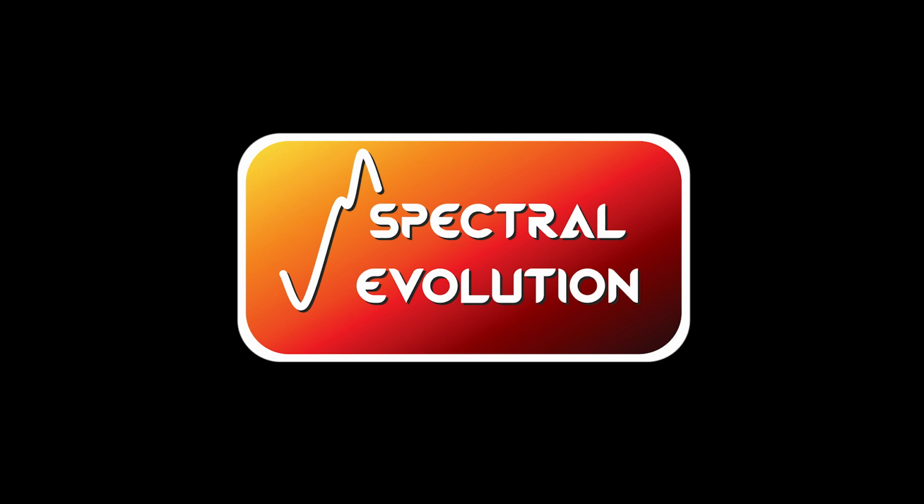We actually have a module in our software called EasyID, which allows you to compare an unknown spectrum to a reference library. By doing that, you can do classification and identification of not only vegetation, but minerals, materials, etc. The software will use an algorithm to look at the location of the absorption features and the depth of those absorption features, and derive the closest match in the spectral library of reference. That also gives you the option to build your own spectral library of reference.